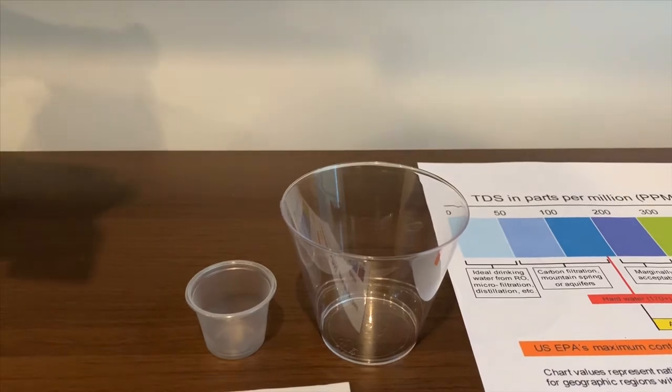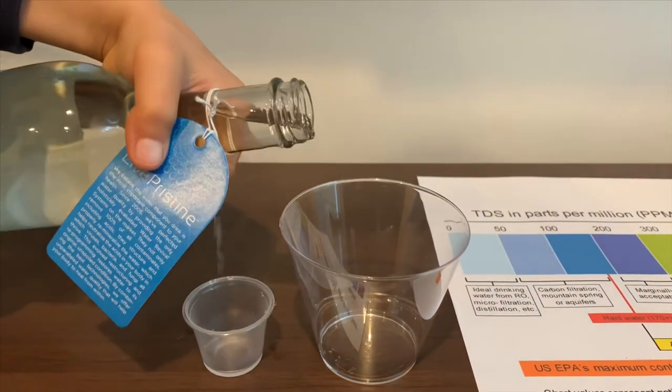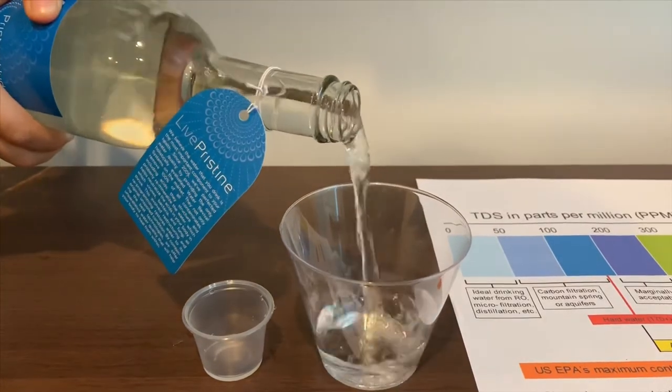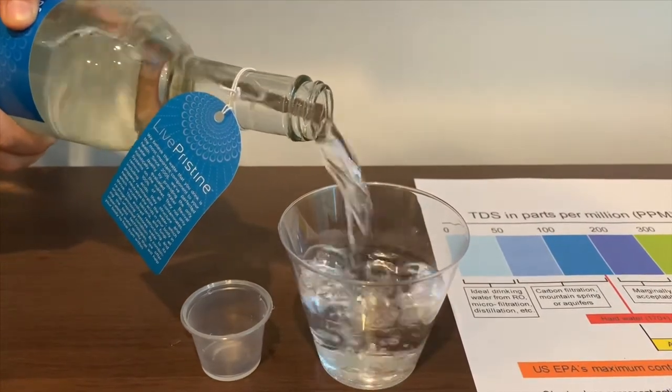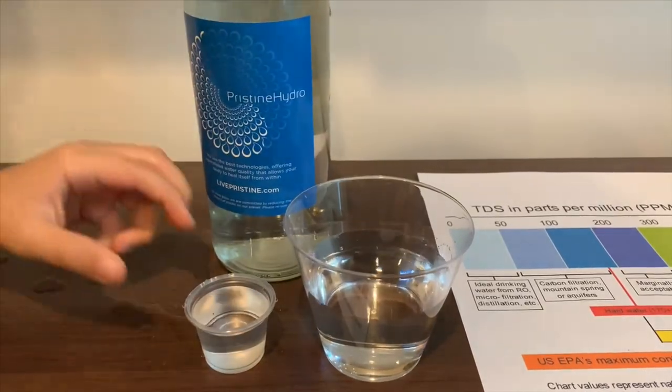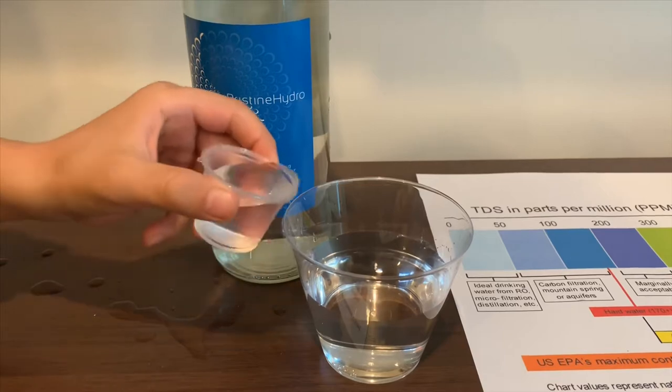Let's pour some water in. This is a little too much for the pH cup, so let's pour some back into the TDS.